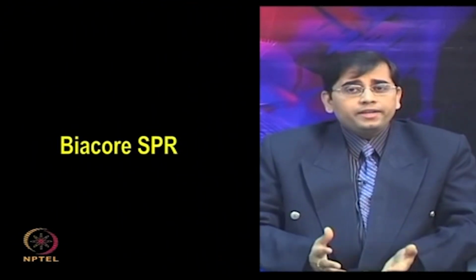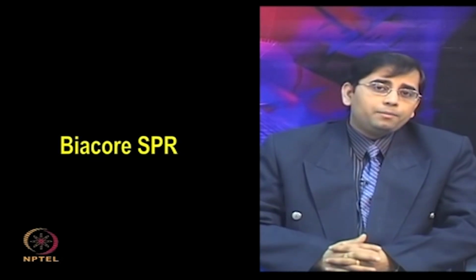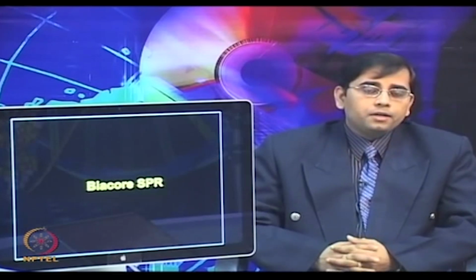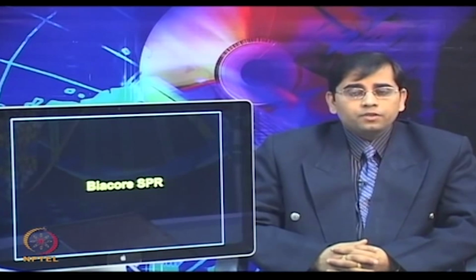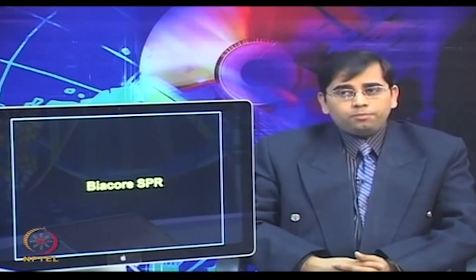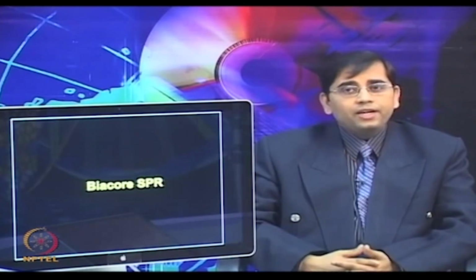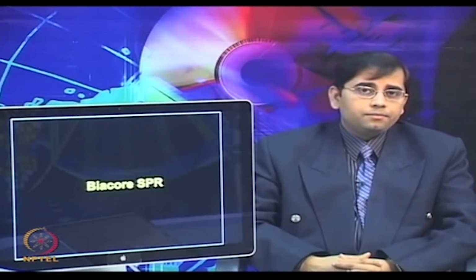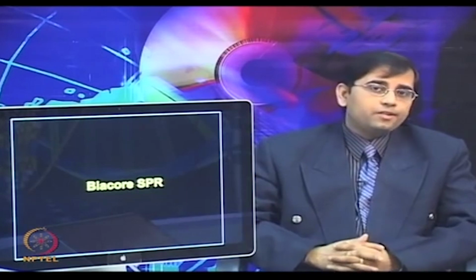There has been growing interest in commercialization of SPR biosensors, which has led to a number of systems available in the market. The commercial instrument from Pharmacia and then Biacore became available in 1990. Biacore are optical biosensors which can be used to monitor macromolecular interactions in real time without the need to label the biomolecules. The Biacore is a versatile platform to determine the kinetic rate constants for a variety of interactions. A number of commercial SPR biosensor instruments are available. Since then, however, the Biacore system still dominates this field.